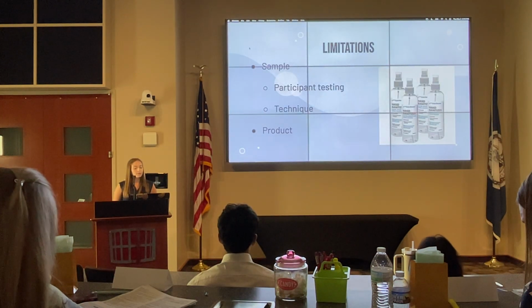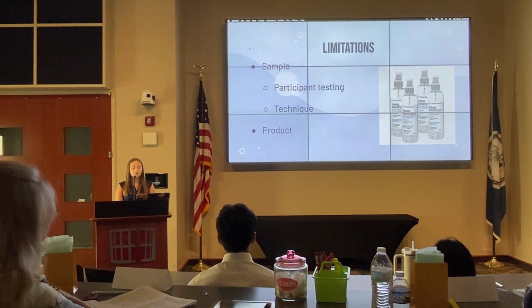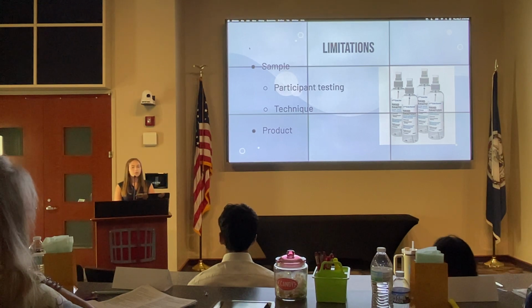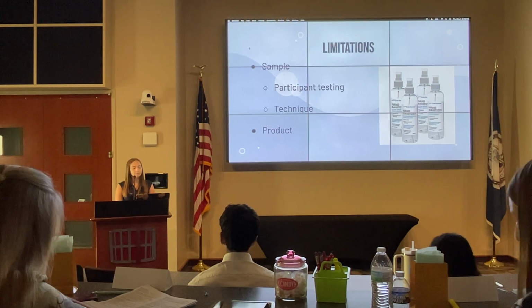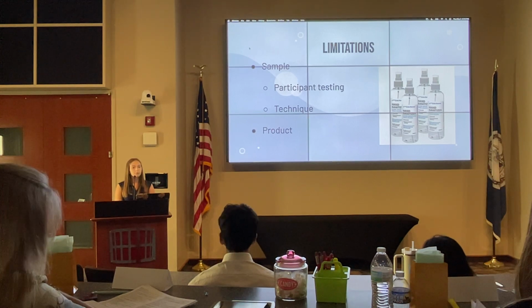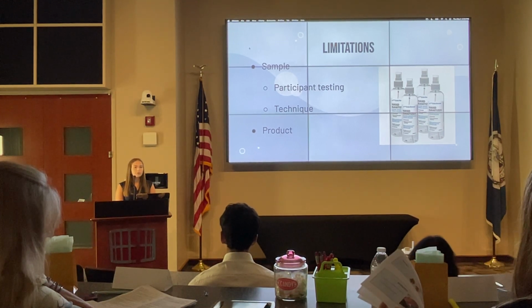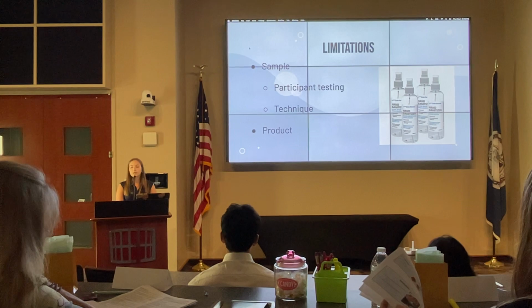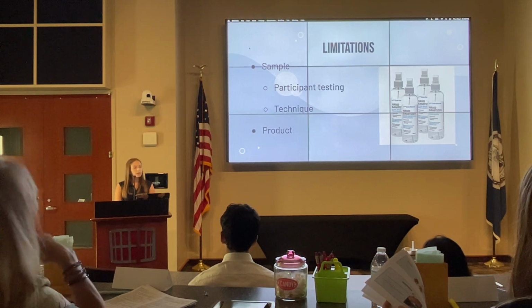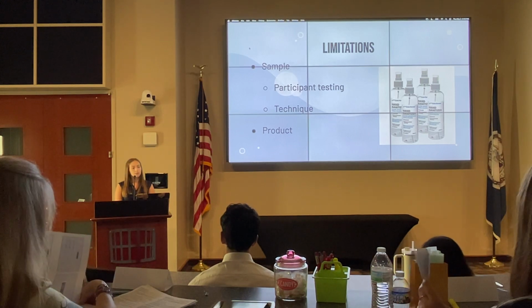The limitations of my study include my sample size and my range of product. Although my sample size was 36, I still consider this to be a small sample and may limit how accurately my results represent the population. Also, the fact that each treatment group was applied individually leaves room for human error and the lack of efficiency of treatment. Lastly, only using one brand of hand sanitizer limits my ability to compare this brand to other brands that were not addressed within my study. In addition to only using this brand, I only chose to use 3 delivery methods of hand sanitizing product.